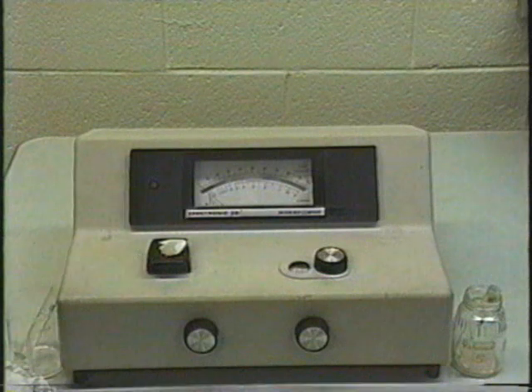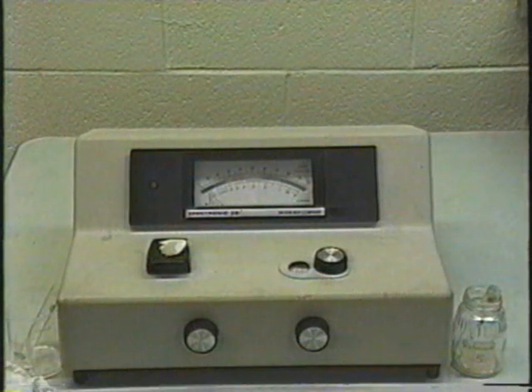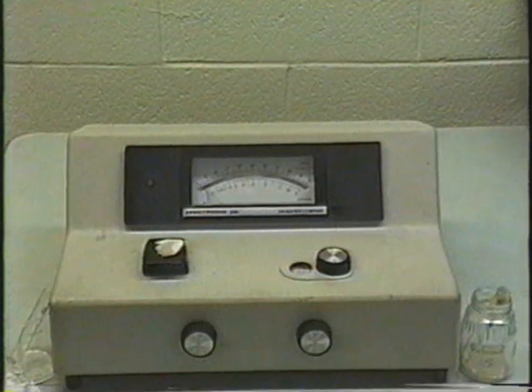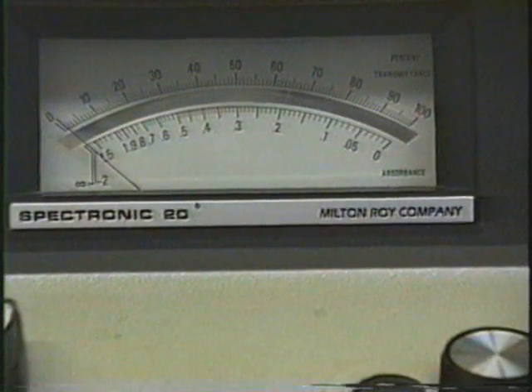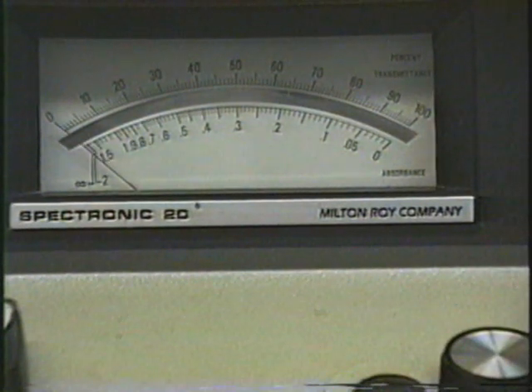At this point then, you can start making your measurements. Now to make these measurements, let's take a little closer view here and get this thing really set properly. Okay, here we are at a close-up. As you see, we're a little bit off the 0%. So we'll adjust it so that it's exactly 0%.